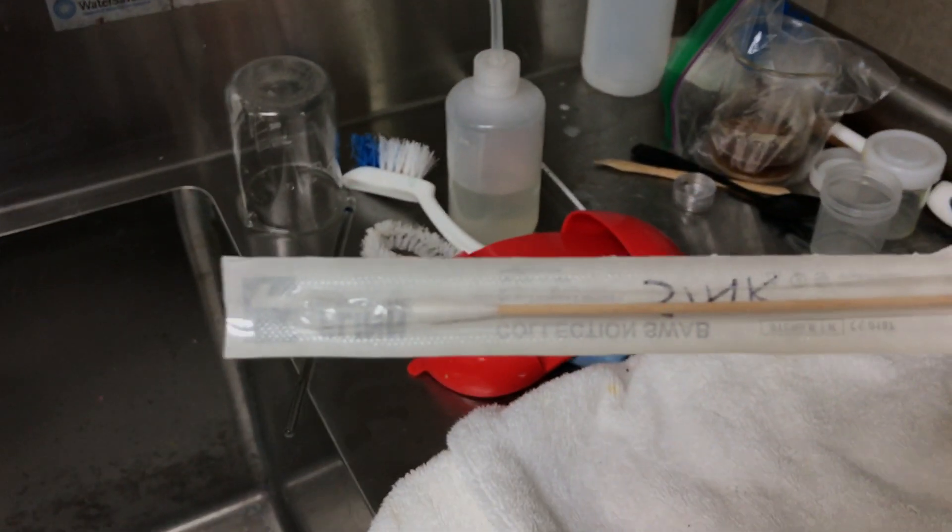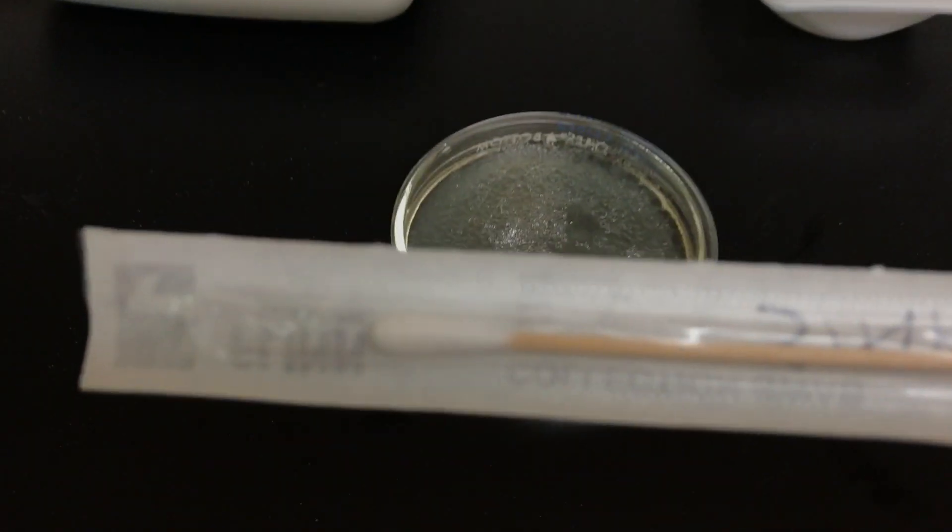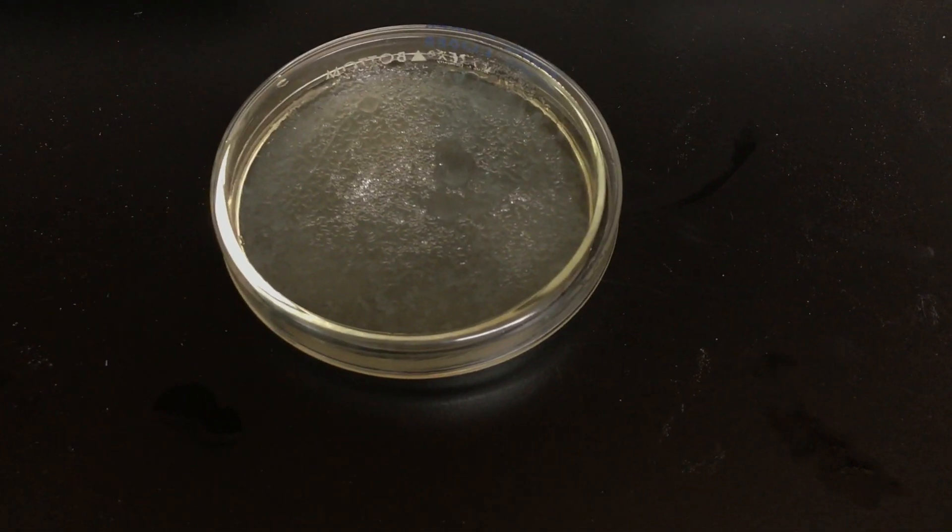Then I immediately want to put it back into the sleeve, because the sleeve is sterile. Then you can go over and put it onto your petri dish. So that is the next little video.